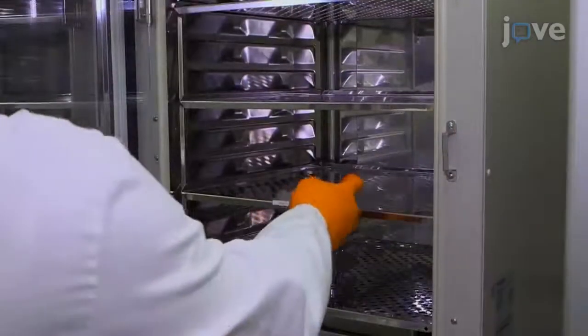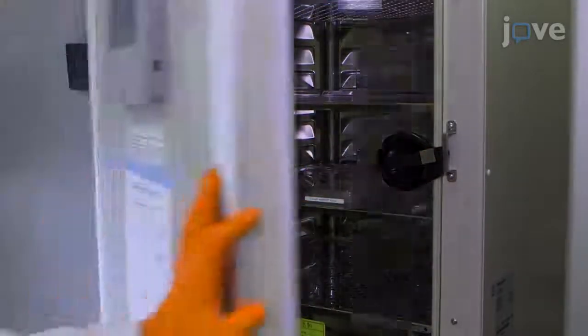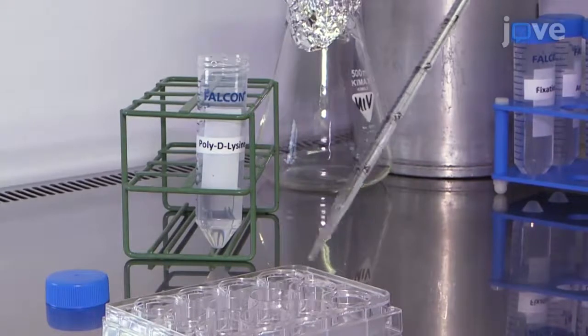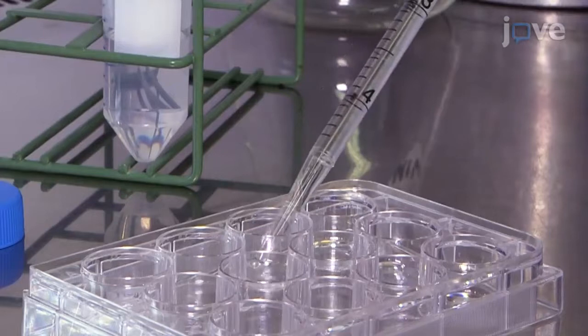Then place the inserts in the cell culture incubator until the cells reach 100% confluency. Coat a 12-well plate with 1 mL of poly-D lysine per well for 4 hours at room temperature, followed by 1 mL of laminin per well overnight.